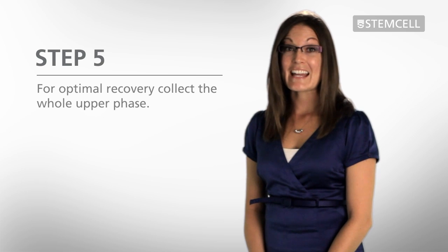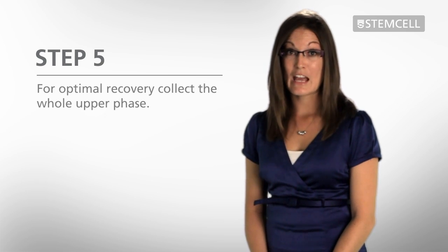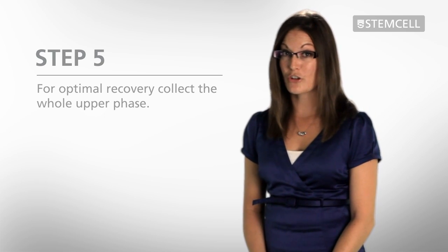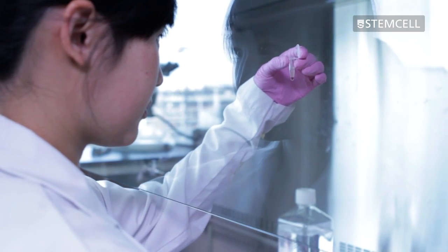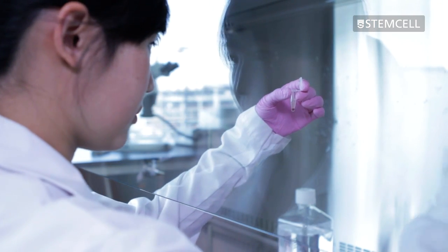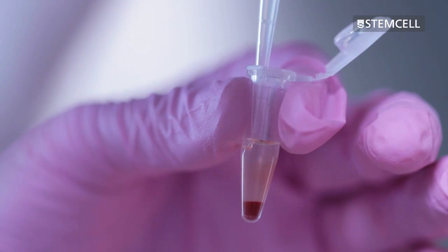For optimal recovery, collect the whole upper phase, but take care not to disturb the red blood cell pellet. Hold the tube at eye level and place the tip approximately midway through the upper phase above the RBC pellet.